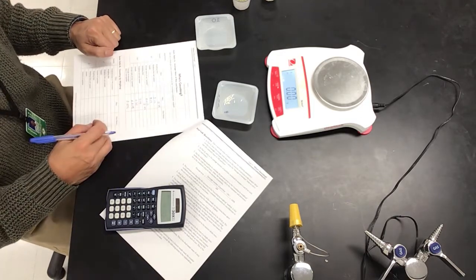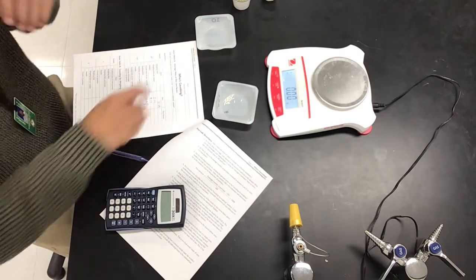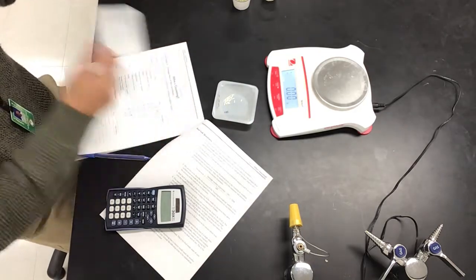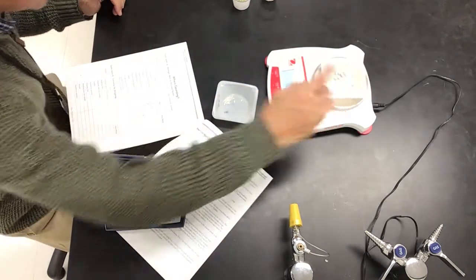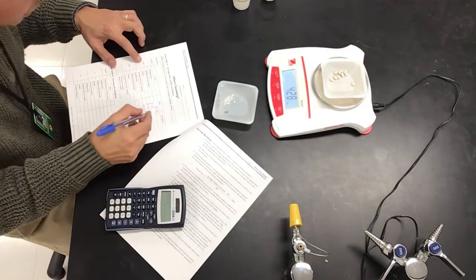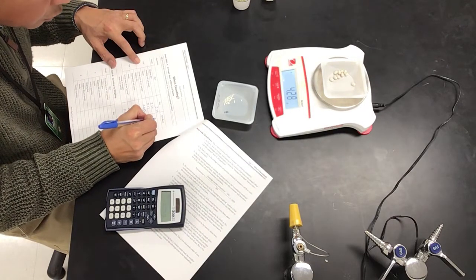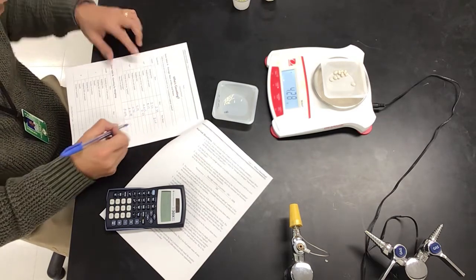So we do the same thing with the bean. I'm going to go a little quicker. The weighing dish is the same. For the 10 beans, the mass is 4.28. You're going to find out the sample, okay?